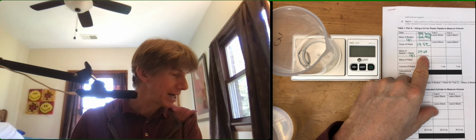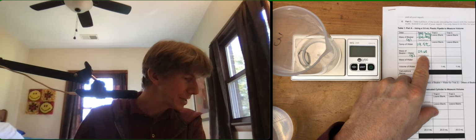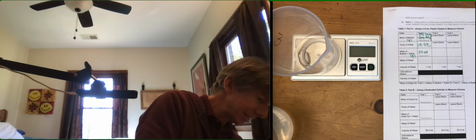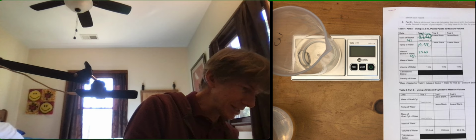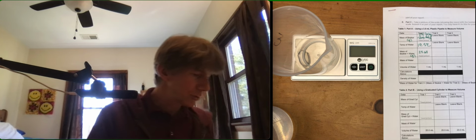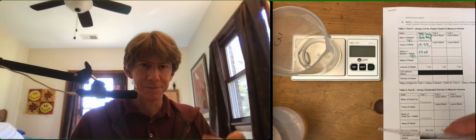So, reading right along, repeat the measurement multiple times to determine precision. Repeat step 5, deliver, and step 7, record mass. Oop, that'll be step 6 when I rewrite this. Step 6, deliver, and step 7 and step 8, record mass. 2 more times without emptying your beaker between trials. All right, so here's what that is.